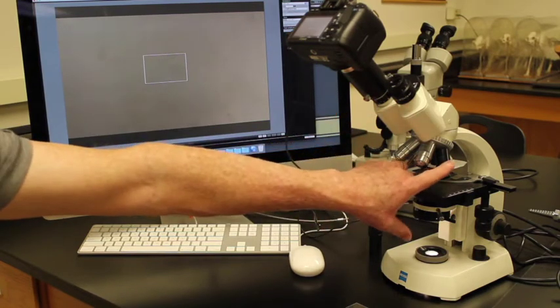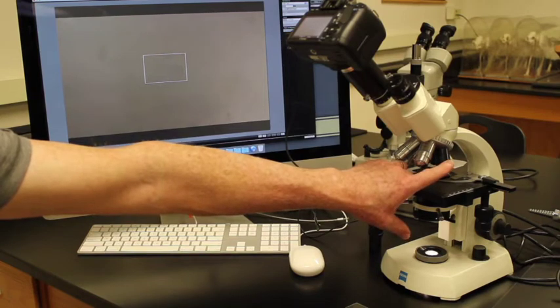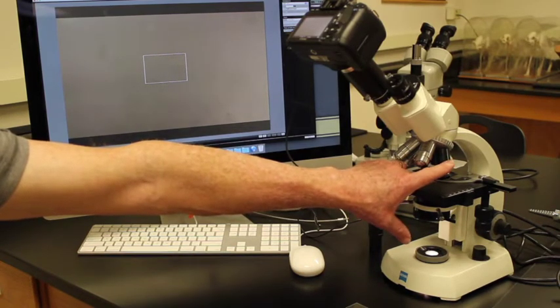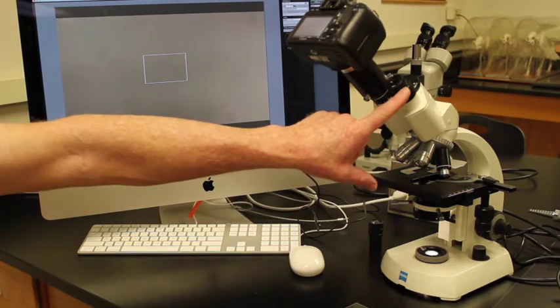Our 100x, then, is our maximum. Our 100x is designed to be used with oil. We will use the 100x at the end when we look at bacteria. That 100x times the 10x ocular is 1000x.